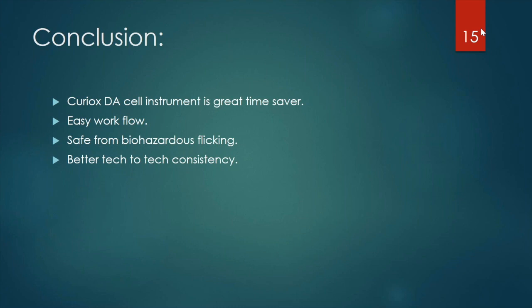Good, thank you. The Curiox portion of the presentation pointed out that they are developing a fully automated workstation. Are you planning to automate the entire workflow? As I showed you, one of the variability would be that you're still adding your serum to the cells and mixing it.